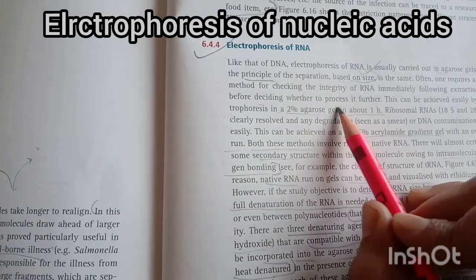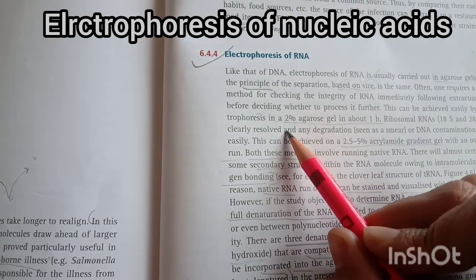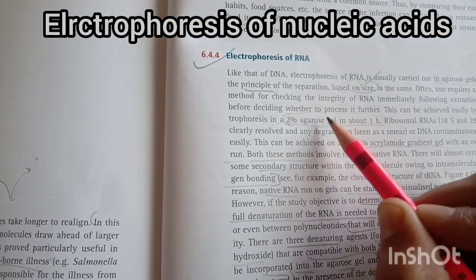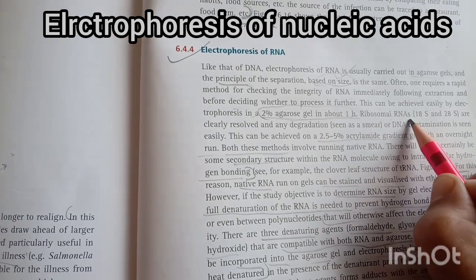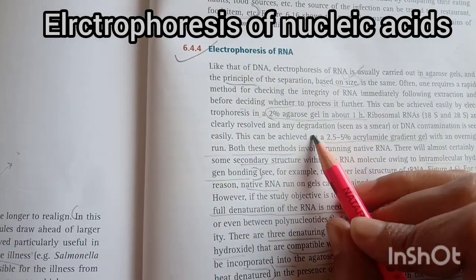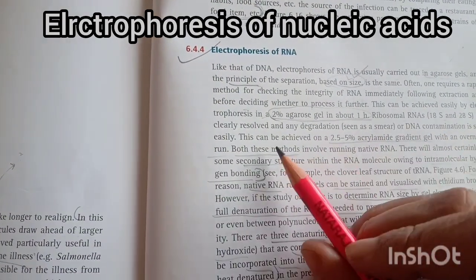before deciding whether to process it. So this can be achieved by electrophoresis in a 2% gel in about 1 hour. So we use agarose gel for about 1 hour. For example, ribosomal RNA, 18S and 28S, are clearly resolved, and any degradation or DNA contamination is seen easily.